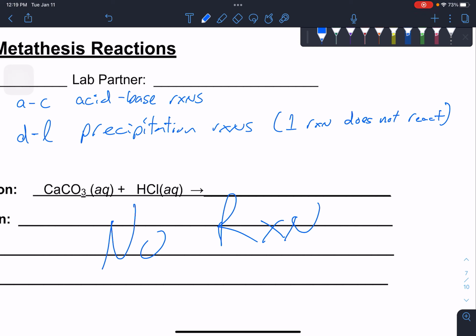How do you identify it? Well, there are 2 ways. You can use the solubility tables and do the double replacement and say, oh, what's going on here? It actually looks a little weird. And say, okay, everything's still soluble. Or, when you do the experiment, you'll see no solid forming. That's the other way to do it. Let me erase that because there is a reaction for that one.